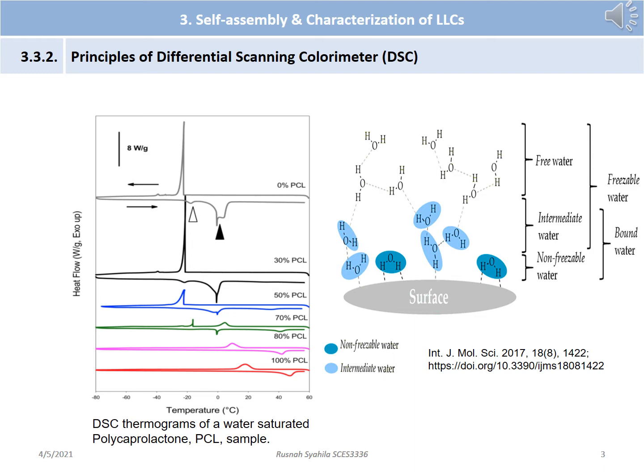Although two distinct water melting peaks around 0 degrees Celsius and -20 degrees Celsius are observed, only one sharp water crystallization peak appears in the cooling trace. According to the classification of three forms of water in the polymer, free water melts at 0 degrees Celsius and a water melting peak at -20 degrees Celsius is attributed to freezable bound water.